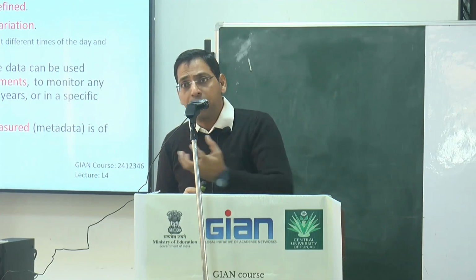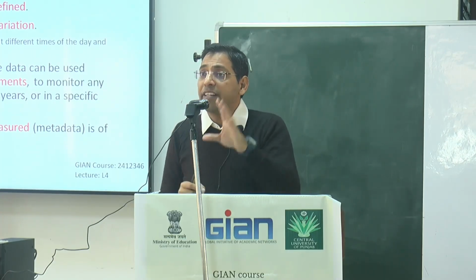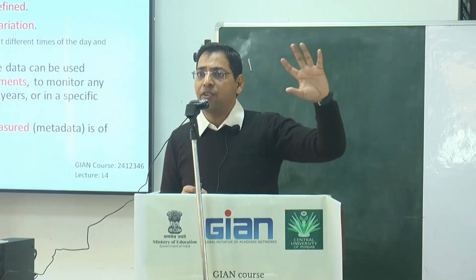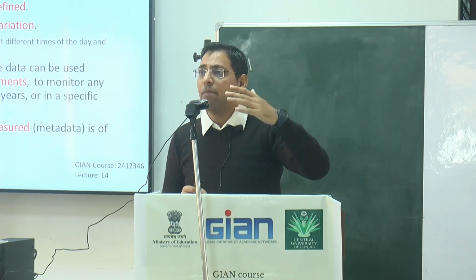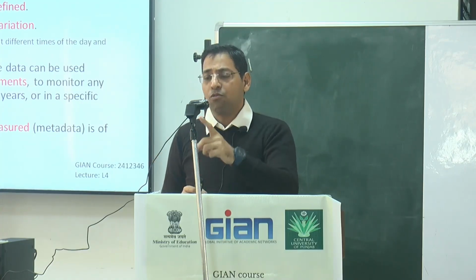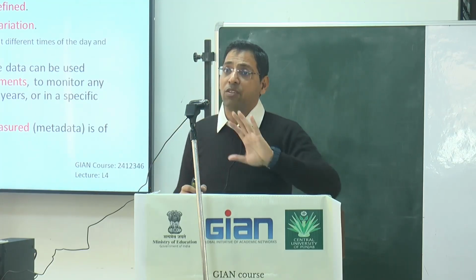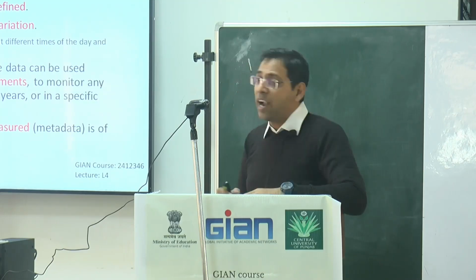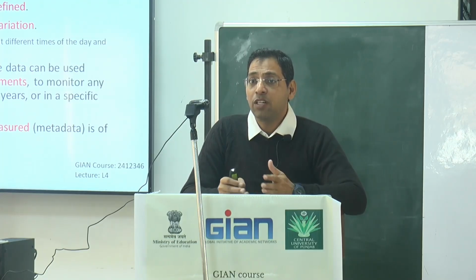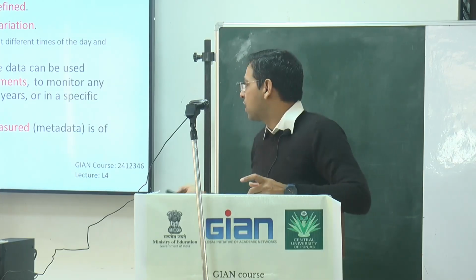Another important point: you can use whatever you are collecting today. If you optimize the condition, then next year, after 2 years, after 4 years, you have already developed a reference with respect to those experimental conditions. Whatever you are doing can be used as a reference material in the near future. So whatever experiment you do, please take each and every one very sincerely with respect to metabolomics. Also, you have to store metadata very well, because next year, if you are doing the same thing, today's stored data can be used as a reference material for the next one.